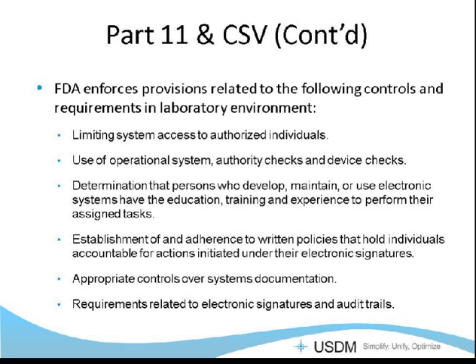Use of operational system authority checks and device checks. If your system has to enforce a series of events, then you have to show in your validation that you do enforce that series of events.